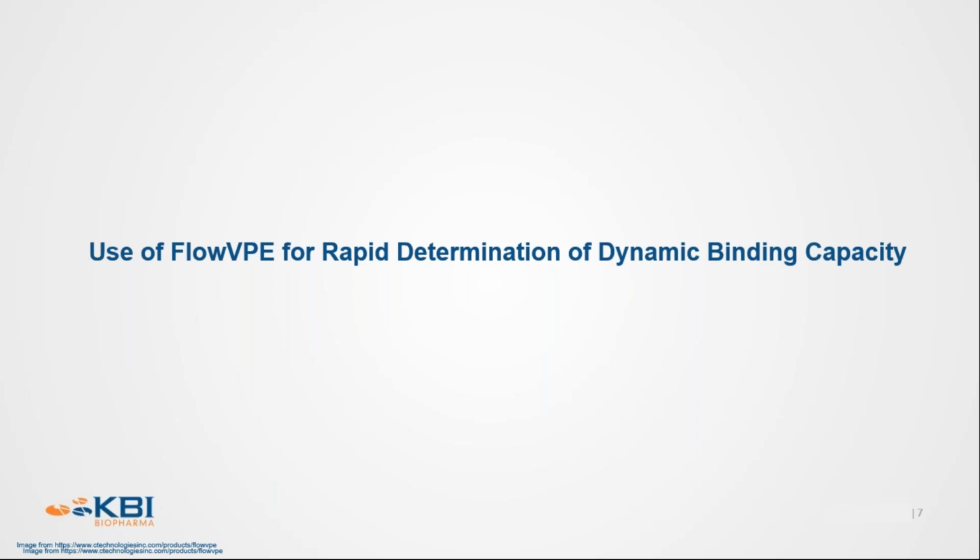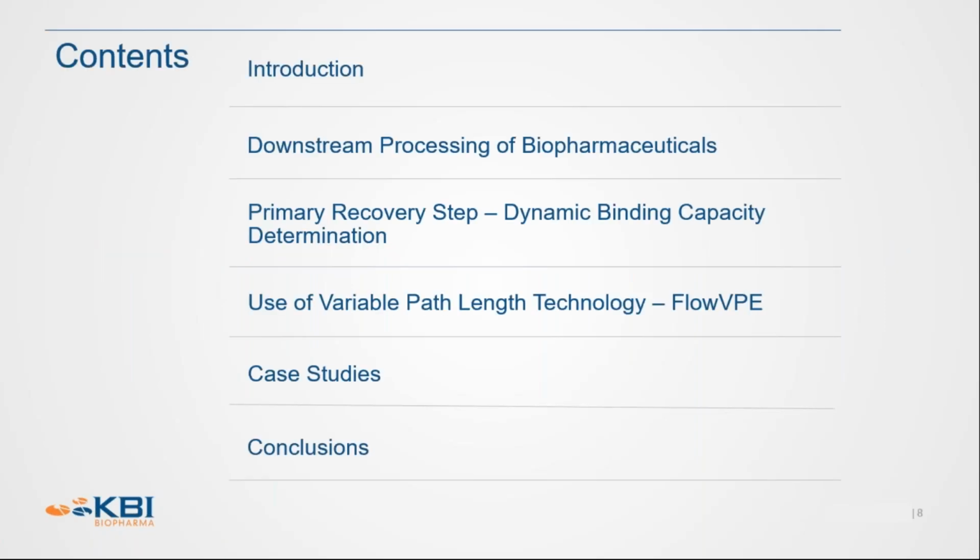We have been constantly using the FlowVPE, which is also based on this technology, but we started using the FlowVPE around 3 years back, and it has helped us a lot. And right now, it is a part of our regular workflow. So I'm going to talk about the principle on which this technology is based, and then I'm going to discuss some of the applications which we have used this for in KBI Biopharma.